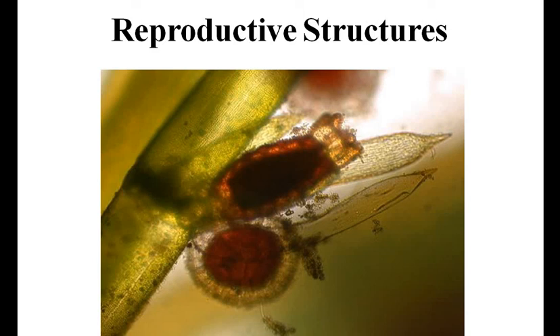The oosphere is single, where a nucleus lies surrounded by the cytoplasm. It is rich in food reserves, which are in the form of starch and oil. After fertilization, the nucule gets modified into a zygote or oospore. The coronal cells at the top of the oospore appear separated.